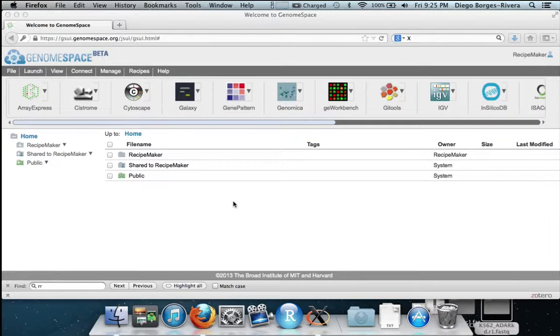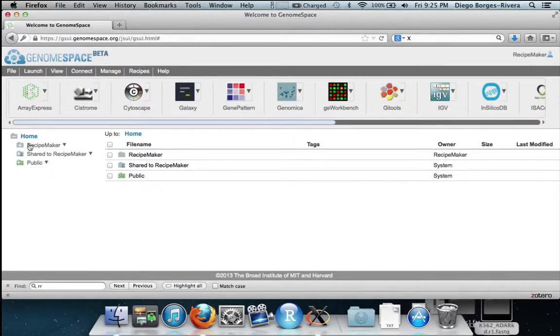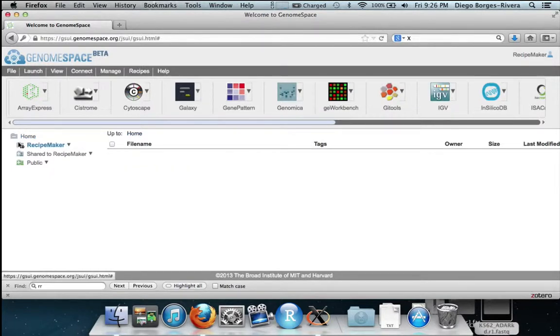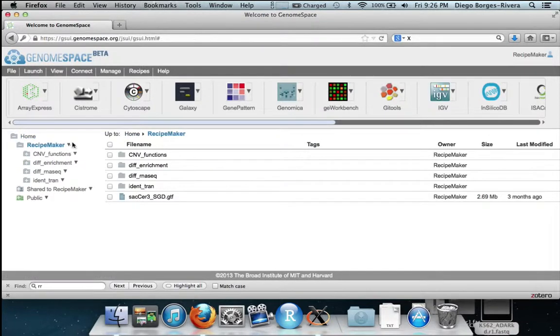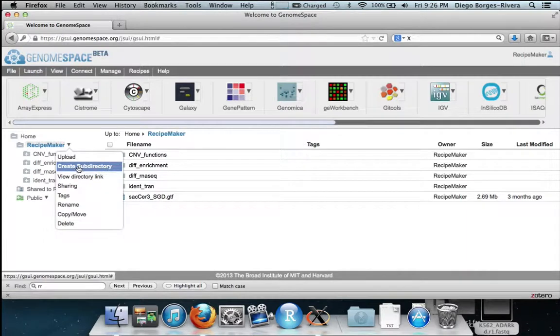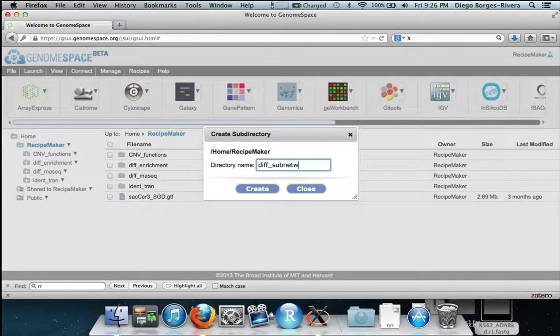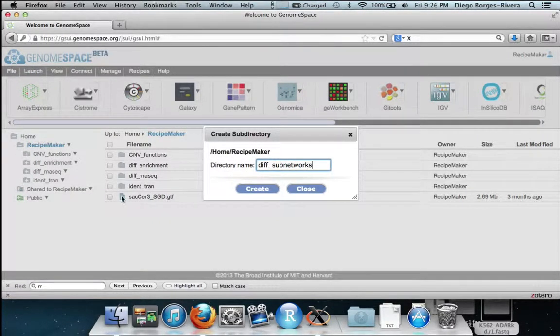We start in our GenomeSpace home directory. We have already logged in using your username and password. We begin by creating a subdirectory named diff_subnetworks in our home directory. We then hit create.